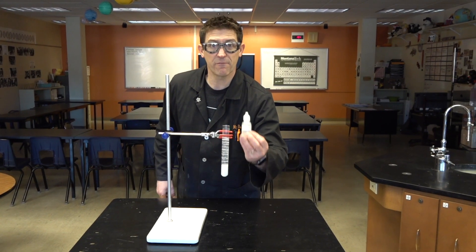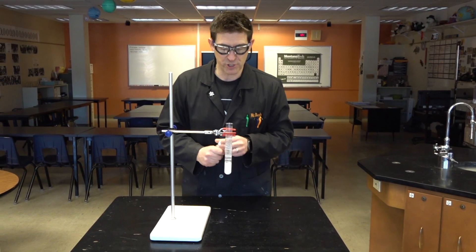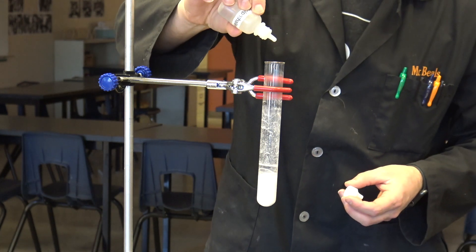Calcium hydroxide is basic. So I've got some clear phenolphthalein. This is an indicator solution that changes color as the pH changes. Let's see what happens when it hits a basic solution.